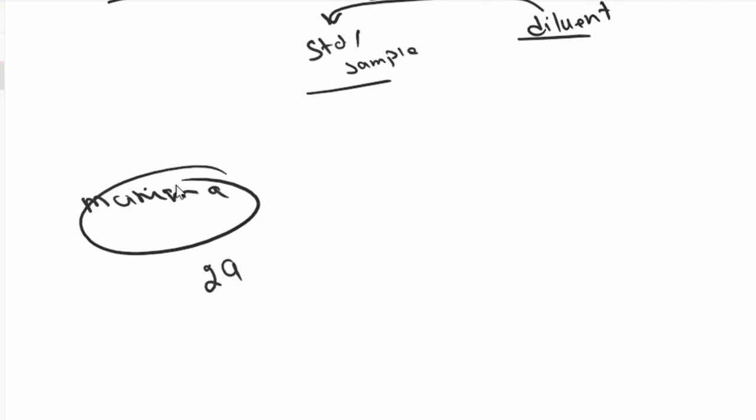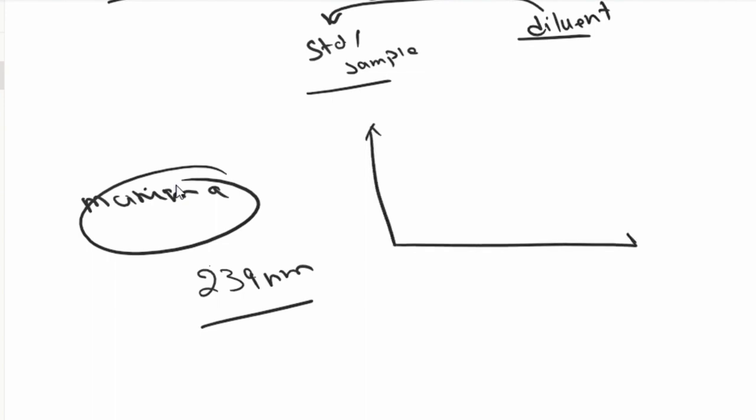That should be 239 nanometer. That's the maximum. For the standard, you will test around 200 to 300 nanometer. That's your range. So the maximum would lie around 239.